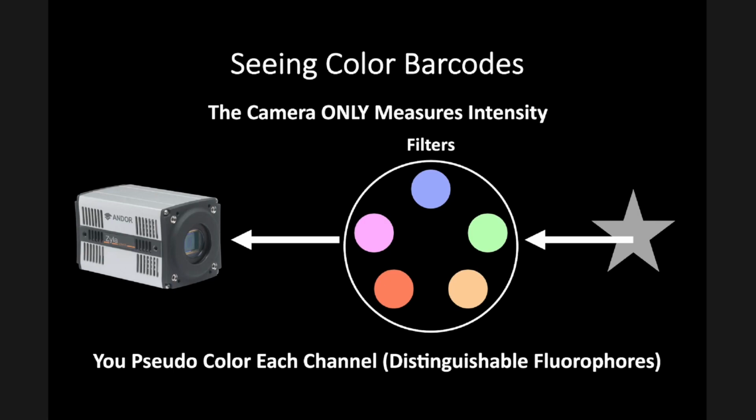But you've probably seen in various journals, sometimes GFP is colored magenta, just because it's easier to distinguish in the backdrop against some other colors, right? And so ultimately, you can pseudo color any color that your camera sees any way you want to, and thus color GFP anything other than green, right?